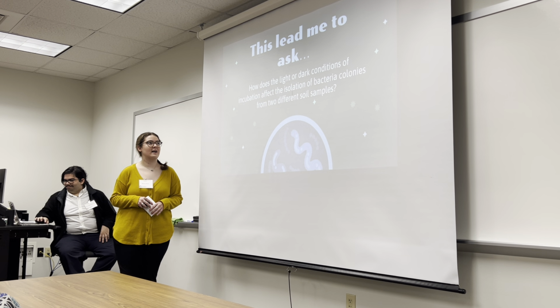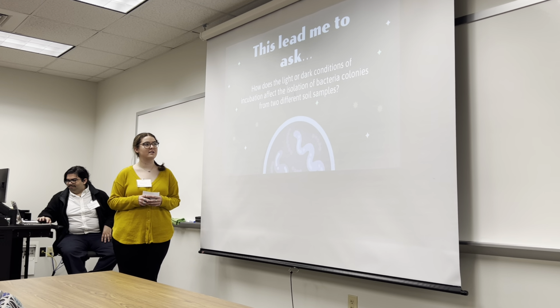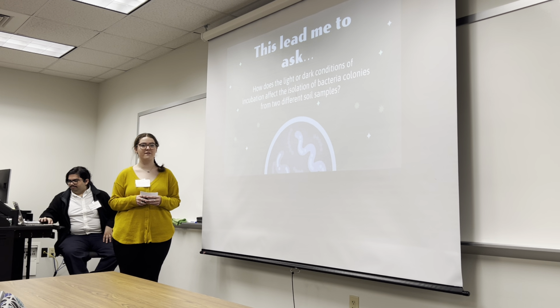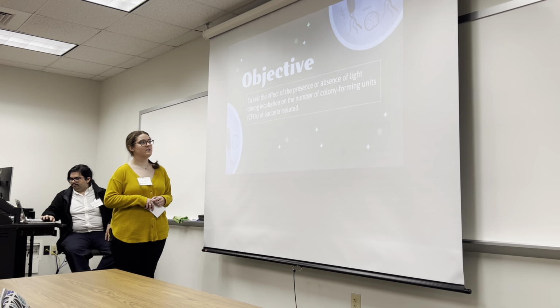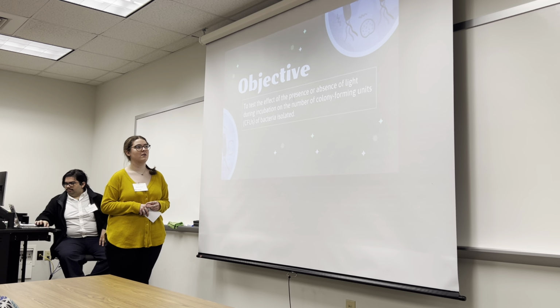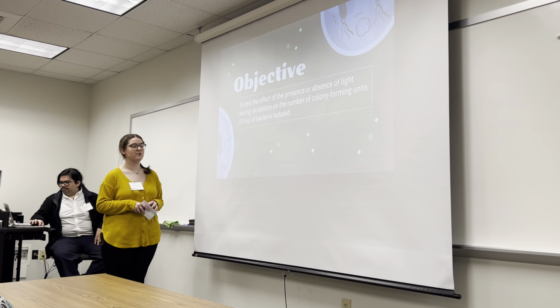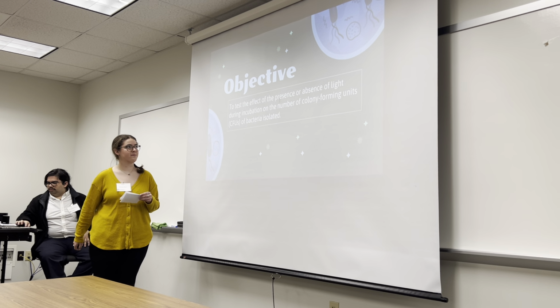So this led me to ask, how do the light or dark conditions of incubation affect the isolation of bacteria colonies from two different soil samples? So my objective was to test the effect of the presence or absence of light during incubation on the number of colony forming units, also known as CFUs, of the bacteria isolated.